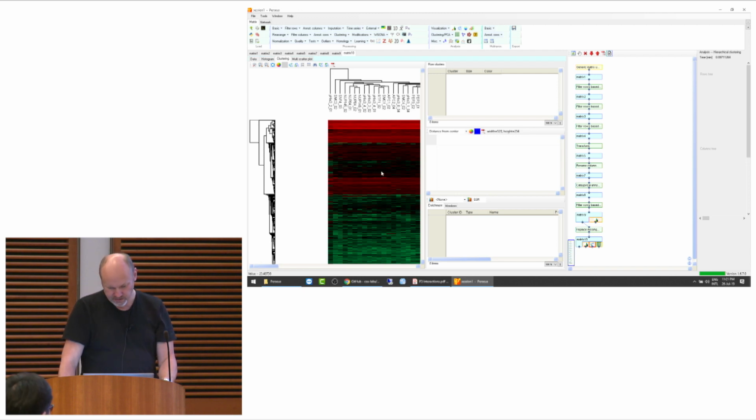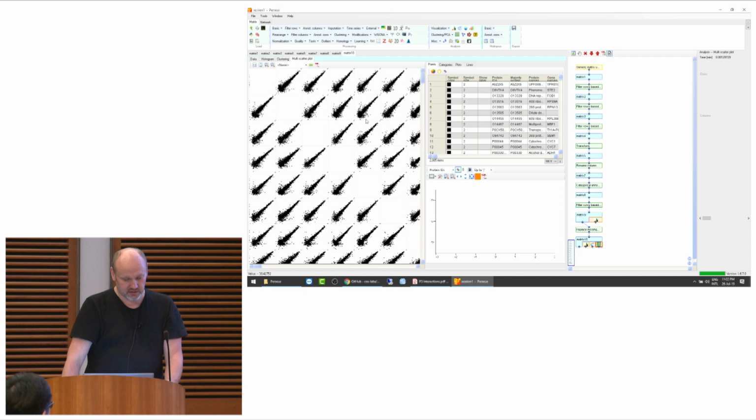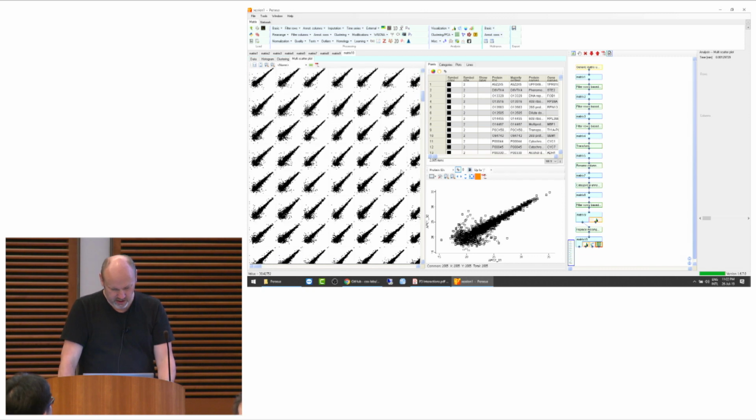So in the heat map, if you don't do z-score or something like this, then they all look the same, which just means that everything is actually dominated not by the interactors but by the background, basically, right? And that's the same everywhere. So that's why this is so homogeneous here, except for the one where something went wrong. And that is reflected in the multi-scatter plot as well, that most of them are actually clustering nicely around the diagonal, if you look at them, right? So you can also select one of these and you see it in large here.